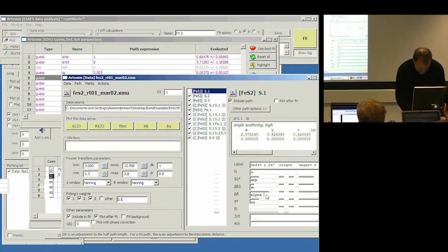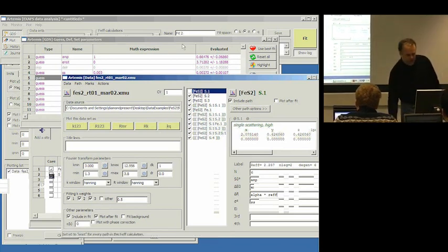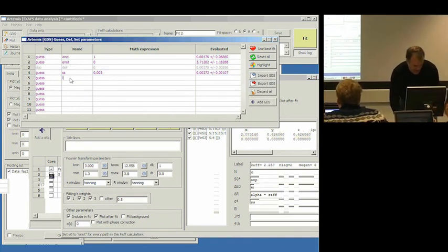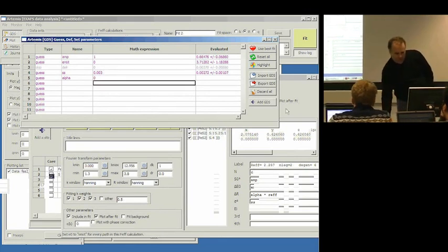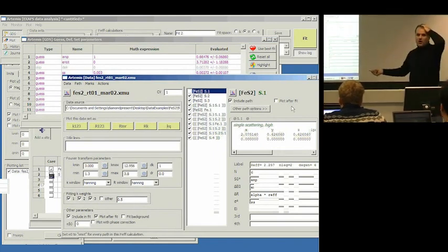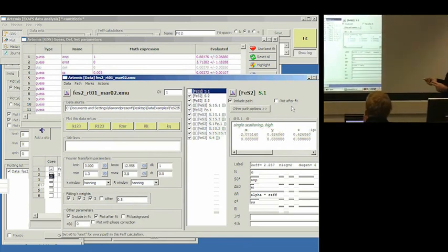Alpha times ref. Okay, there's a whole bunch of interesting things here. Oh, and we need to define the alpha parameter. So, alpha, and we'll define that to be 0. Okay. So, there's three interesting things, I suppose, that are going on here. One is a new parameter that we're calling alpha and that we're going to interpret somehow differently from the delta R parameter that we had before. We'll get to that. Interesting thing number 2 is this word ref.